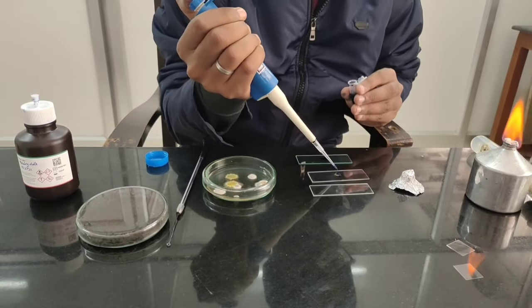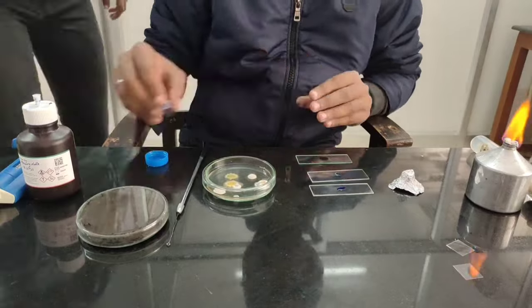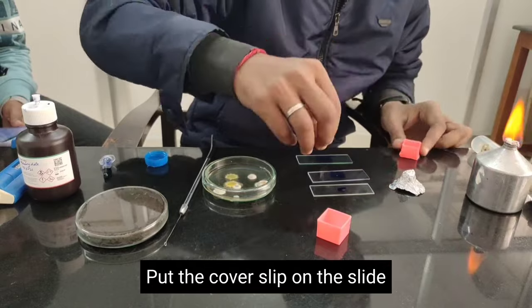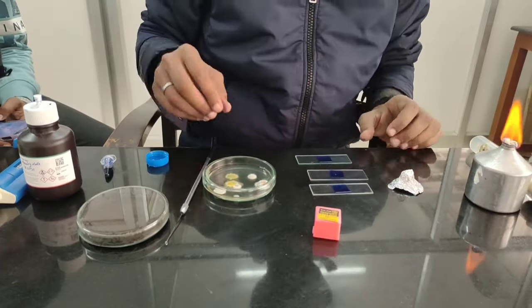Then we add one to two drops of lactophenol cotton blue dye. After adding the dye, we place the cover slip carefully so we don't have air bubbles and we don't have any slide drop.